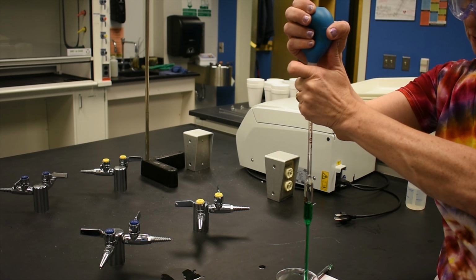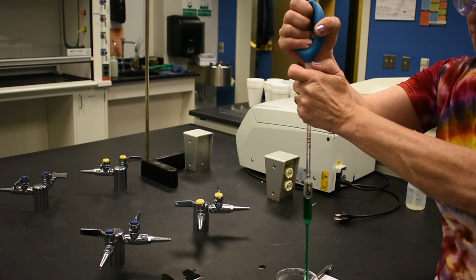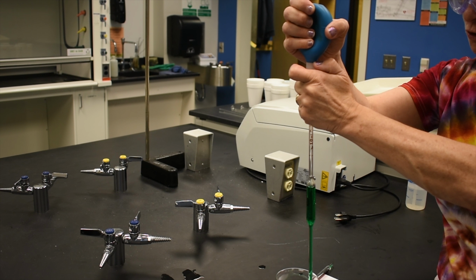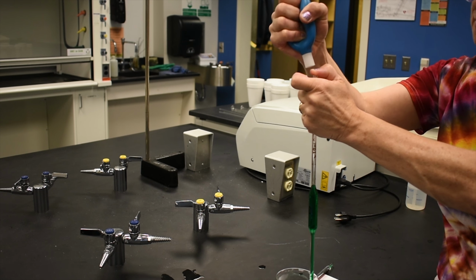Not going to have 10 milliliters yet, so I'm going to remove the bulb, cap it off, squeeze the bulb out, continue to pull it up, and since this should be the last time I have to do it, I have to be careful not to pull too much up into the pipette. And I didn't get quite enough, so I'm going to do it one more time.